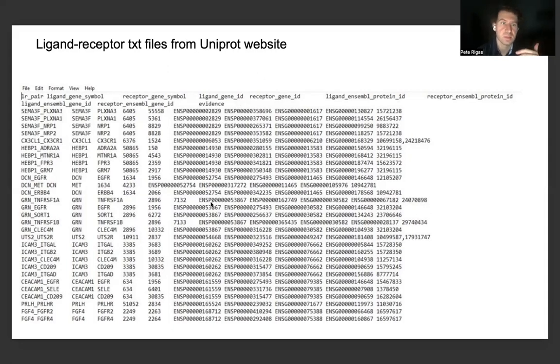And this provides us with a wealth of information because we can have an idea about how many amino acids are contained, or how many components are contained also in the sequence that we would like to run AutoDock Vina on, as well as different combinatorial options for different combinations or pairs of ligands and receptors that we can look to examine further in our simulation efforts.